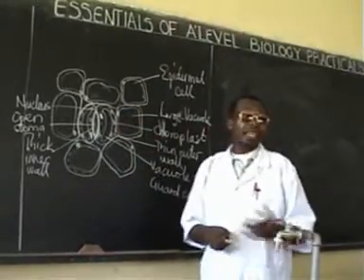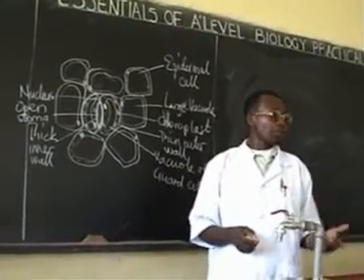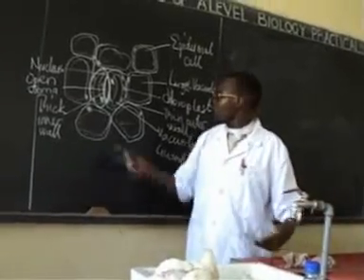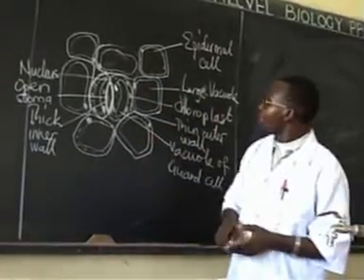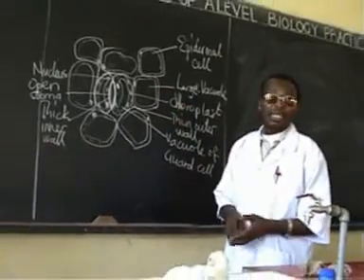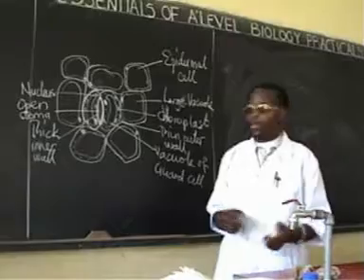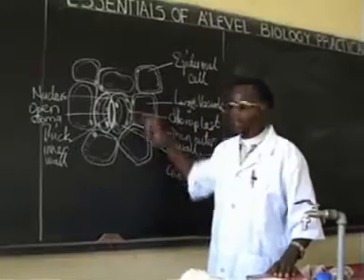So these cells had taken in water and they are turgid. But usually candidates are given more than one solution. You can be given 2 or 3 solutions. One of the solutions may be hypotonic, one may be hypertonic, and one may be an acid that will just destroy the cells and you will not see anything. So if you have a hypertonic solution, instead of the cells being turgid, they will be plasmolyzed. The vacuoles will be pushed towards the center and the cytoplasm will shrink. You will even see that the stomata will close and you will not be able to observe the large vacuoles that we have had here.